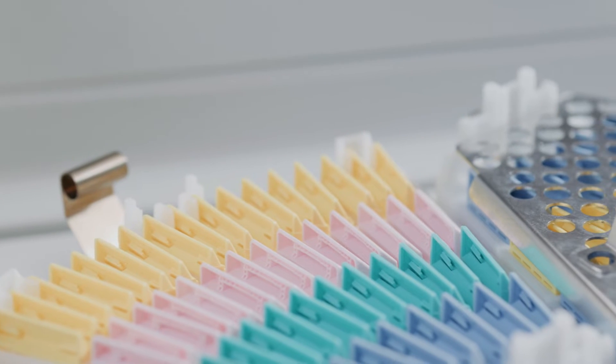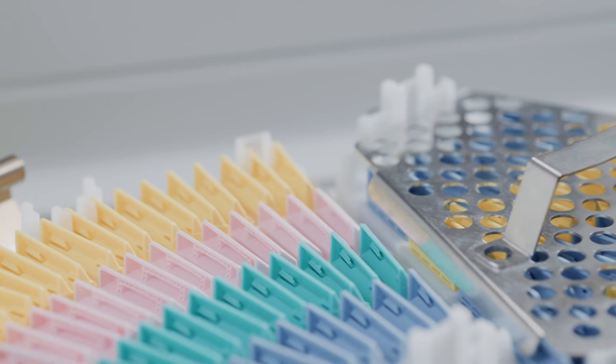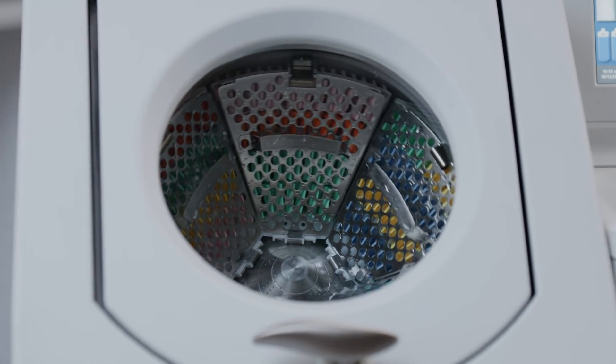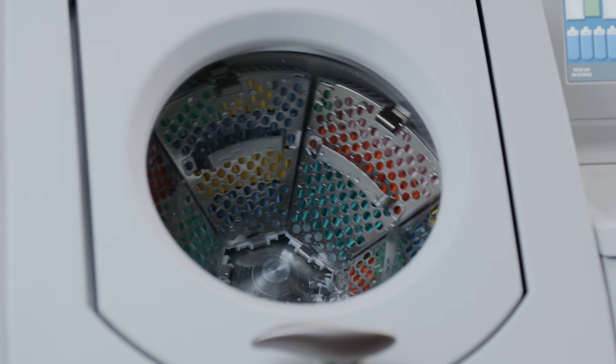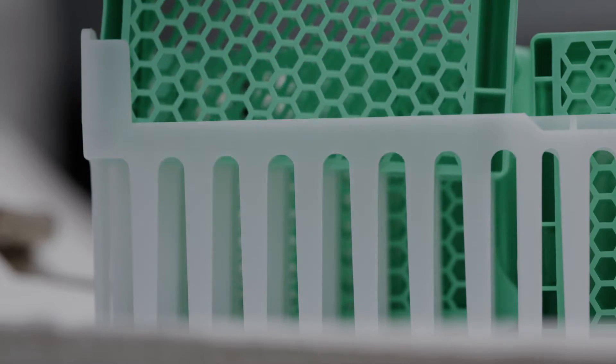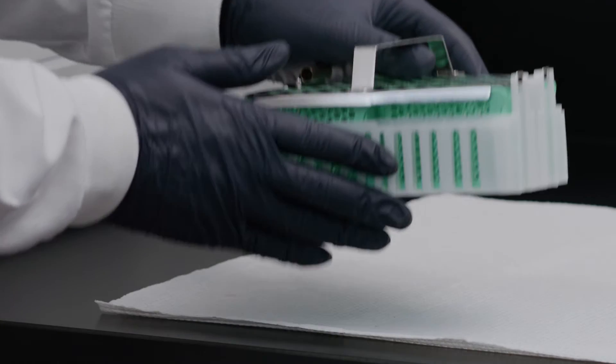These baskets, coupled with the Revos system's unique rotational agitation method, help ensure optimal reagent exchange for even faster, high-quality tissue processing. With the Revos system, you can process up to 300 cassettes or 42 super-mega cassettes per run.